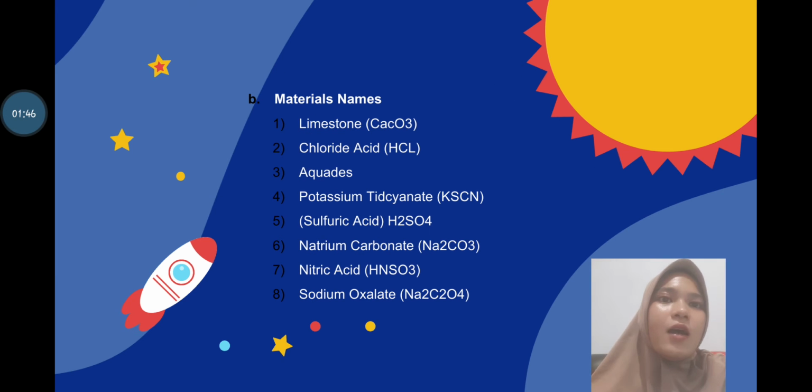Materials: limestone, hydrochloric acid, aquades, potassium thiocyanate, sulfuric acid, sodium carbonate, nitric acid, and sodium oxalate.